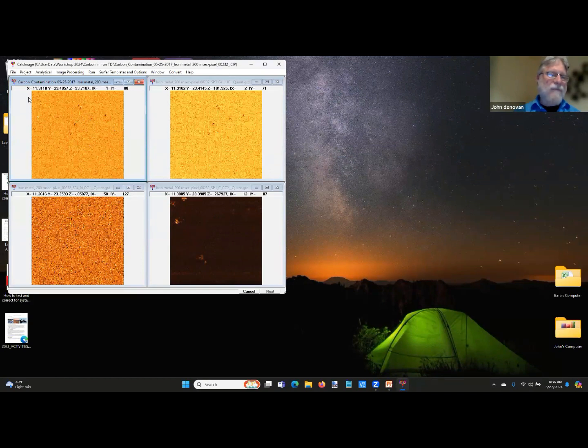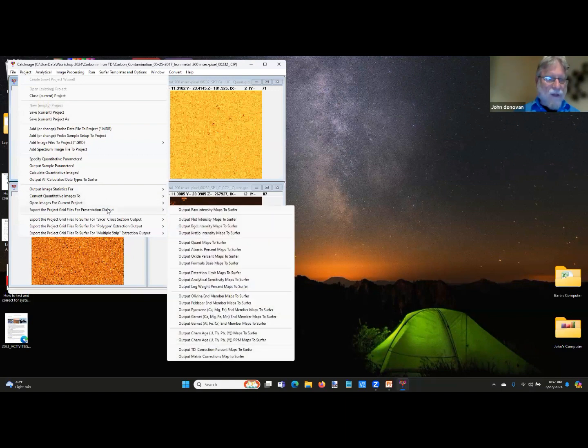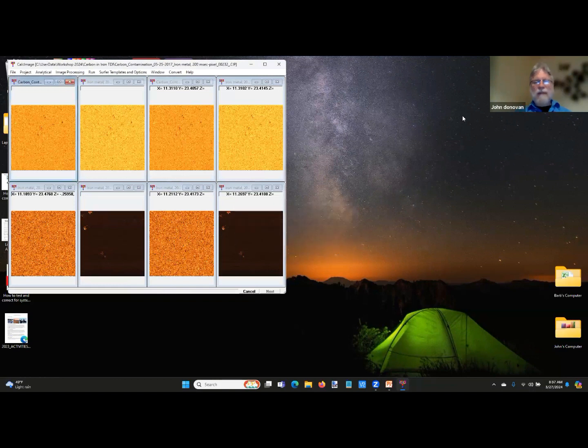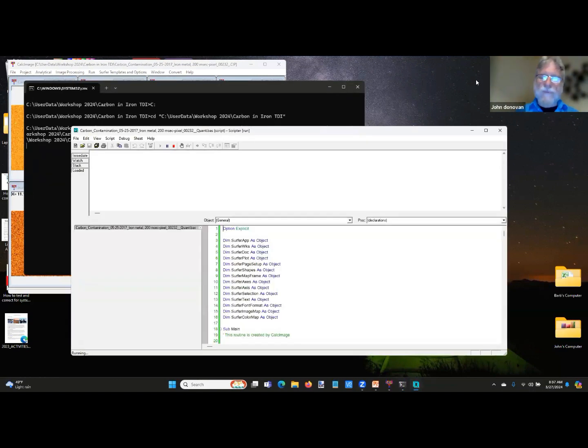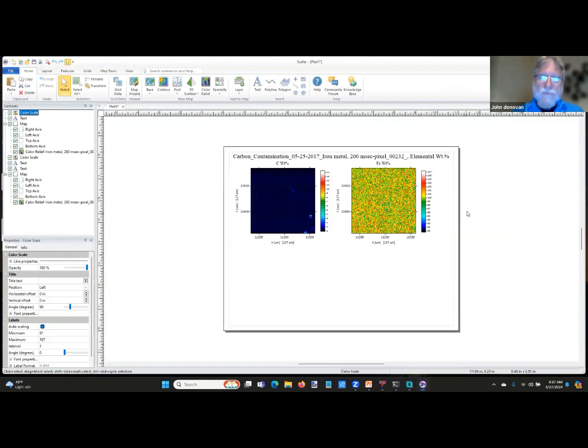If we want to see this more clearly, we can export this. We provide this with our software. You can create a presentation quality output, and we can just run that. It takes a pre-formed script, which you can edit to your heart's content, and it will now display those results here.